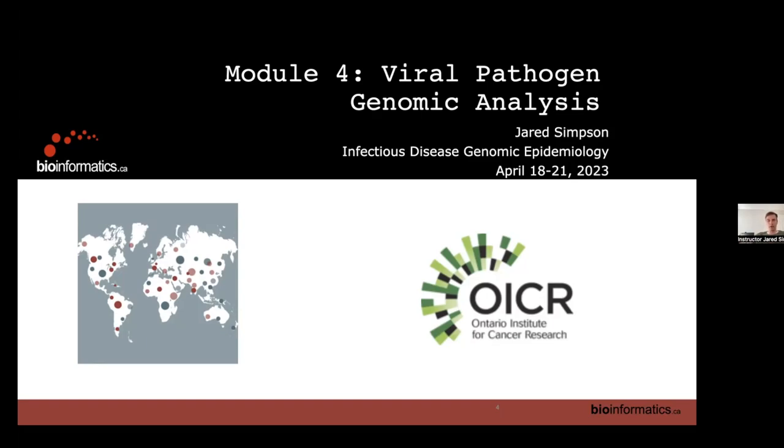And then when we were putting together this workshop, I offered to teach this module on how we interpret sequencing data from viruses. So this is going to be very specific to coronavirus, and particularly the way that we sequence coronavirus, which was using amplicon-based schemes where we take tiled PCR across the genome, amplify those segments of the genome, and then try to reconstruct what the sequence of the virus was from those tiled segments. I'm going to get into all of that as we go throughout this lecture. But just to say that this lecture is very focused on viruses and particularly amplicon-based analysis.